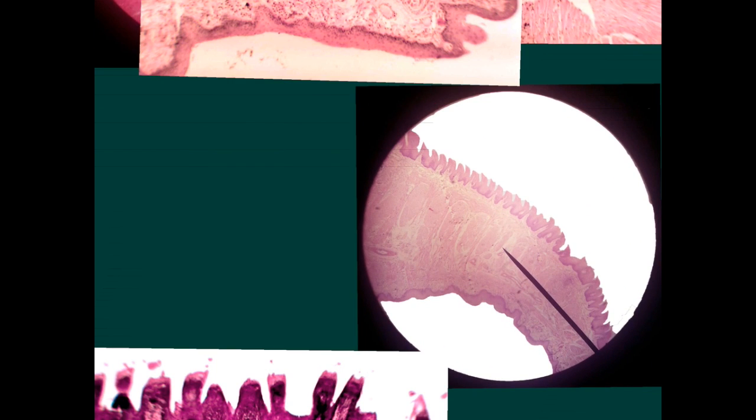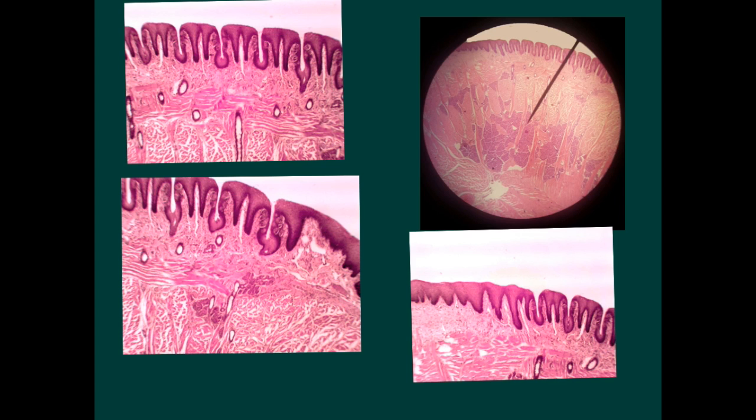So, this slide is characterized by being like a triangle, and it is pointed, and one surface shows the papillae and the other is smooth, and the big bulk of muscle in between can be seen. Of course, this is the tongue of human. Then we have the tongue of rabbit that you have to differentiate from the tongue of human.